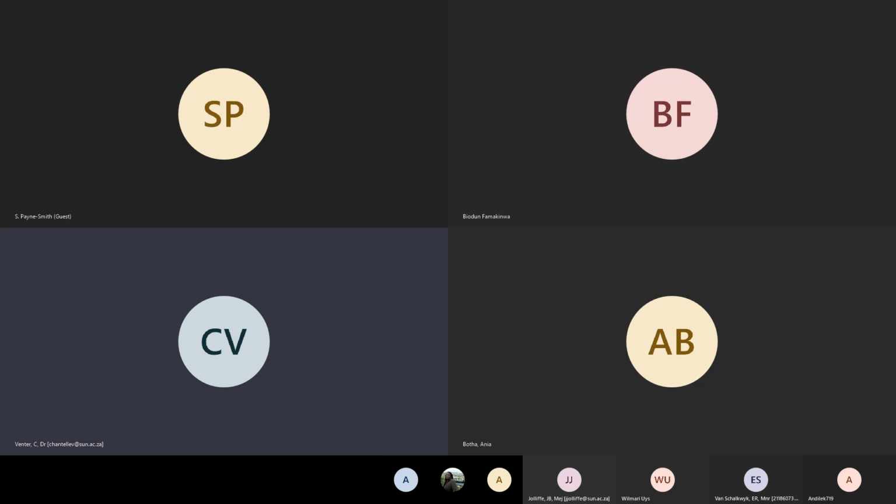Okay, I have a question from Anya that says, when you prepare your sample for H&E, what are the main things to consider? So if we're talking about wax embedding samples, of course, first of all, you can't start staining your samples directly after you cut or section them. So they have to have properly dried on the slide.